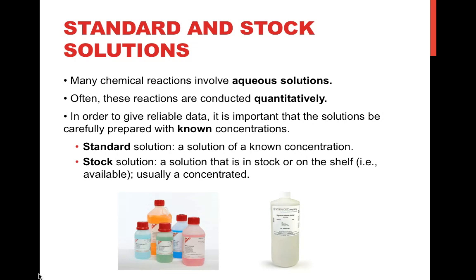So for example, when I was going through doing my PhD, I had my lab bench, and if you looked at the top of that lab bench, there would be a whole series of solutions that I've made up, and they were all labeled. So those are all stock solutions. They're solutions that are labeled that are on your shelf. And scientists will typically use those as a way to try to cut down on having to make a solution every time, and they'll take a little bit of it every time they need it.